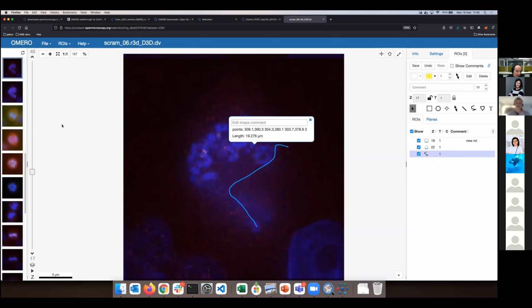That's very nice. Now let me show you the viewing in Multiview. Let me do the multi-view, then we go back to the web client. I will go through the HCS, and then we will do the search, because that gentleman with his question where the things are lost, I forgot his name, is maybe still looking for his image. I would like to give him a hand, so we will make a swap.